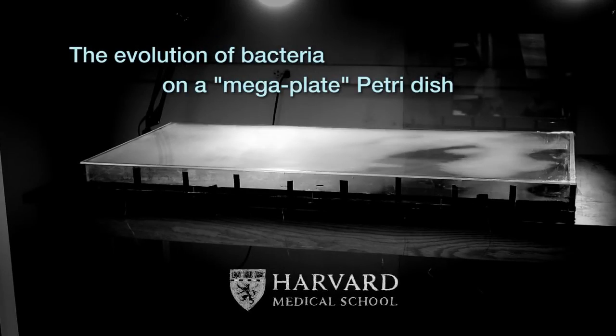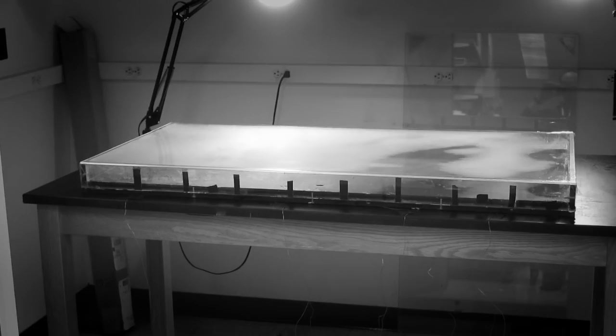So what we ended up building was basically a Petri dish, except that it's 2 feet by 4 feet. And the way we set it up is that there are 9 bands, and at the base of each of these bands, we put a normal Petri dish thick agar with different amounts of antibiotic. On the outside, there's no antibiotic.